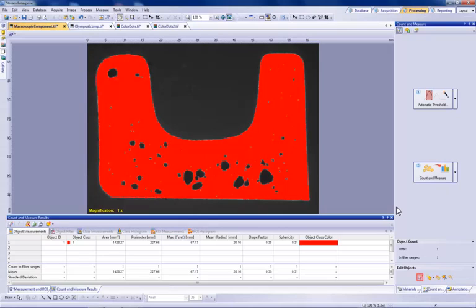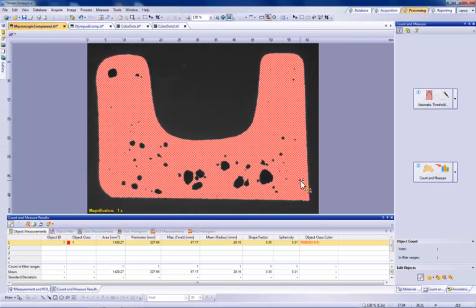Select the Detected Objects arrow button so we can select the large detected object by simply clicking on it. Now that we have the area of interest selected, we simply right-click to bring up our drop-down selection menu. In this window, we can select Create ROIs from selected objects. Now we can see the definition of ROI 1 or Region of Interest 1 on the selected area. Next, we will select the drop-down menu for Count and Measure. From the drop-down menu, we will select Count and Measure on ROI to activate this option for use.